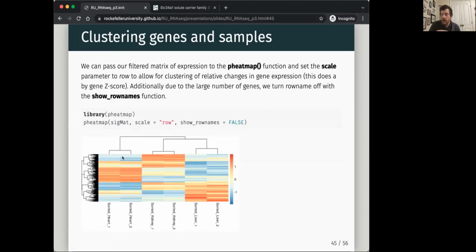Quite often when I talk with people who are a bit naive with bioinformatics, they're like, why can't I just plot the count values? I want to see what the counts look like in this heat map. But some of these counts are going to be thousands and thousands, and others are going to be hundreds or 10. But they might actually, across your liver, heart, and kidney, be behaving very similarly.